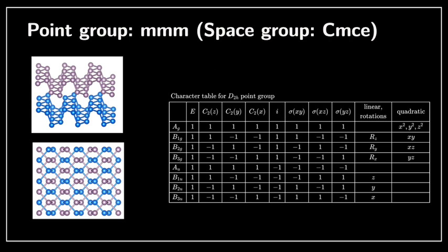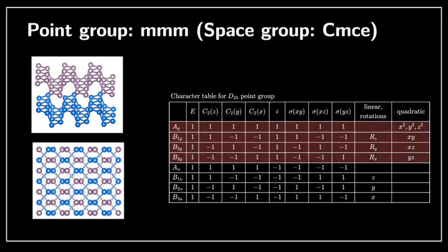And as I mentioned to you, the modes that we expect to be Raman active by symmetry are those that behave like quadratic functions. So in other words, only the first 4 modes could be potentially Raman active. The other ones are not Raman active. So there is no way that we will see a peak that corresponds to the Au, B1u, B2u, B3u. And the reason for that is because those particular vibrational modes, with those irreducible representations, do not, by symmetry, correspond to a change in polarizability. And as you know, the change of polarizability is really what makes up the Raman tensor.